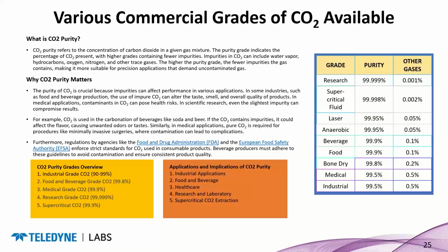There are various commercial grades of CO2 available. Obviously, the purer the material, the more expensive it is. You can buy what's termed a supercritical fluid grade purity material these days. Sometimes you can get by with lower purity grades, depending on how you're utilizing your CO2 and how you're bringing it into your instrumentation in the lab.